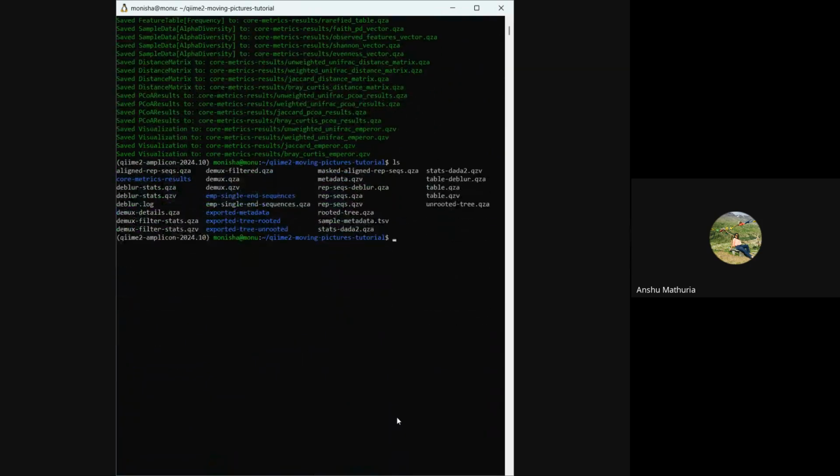So you can see, right, a core metrics results directory is created. Now please go into the directory. Sorry, ma'am, I couldn't hear you. Can you please go into the directory that is core metrics results?